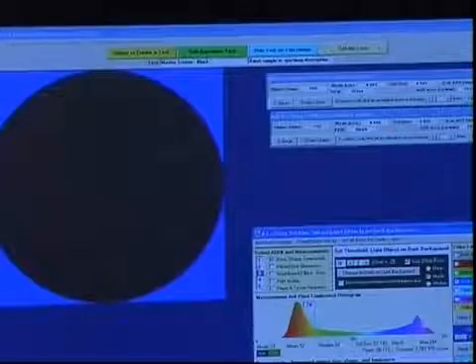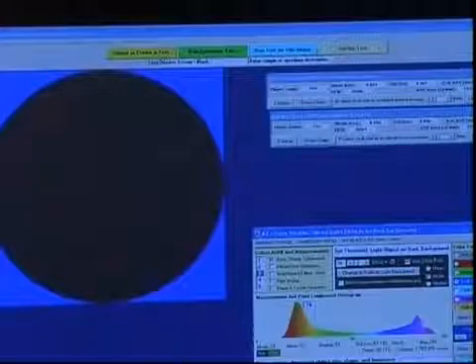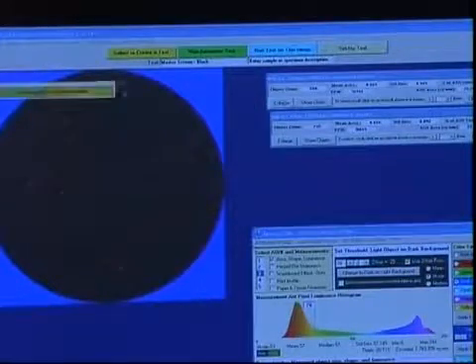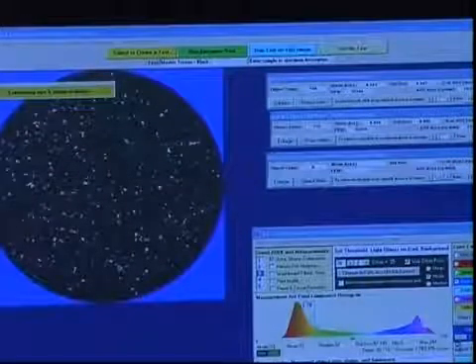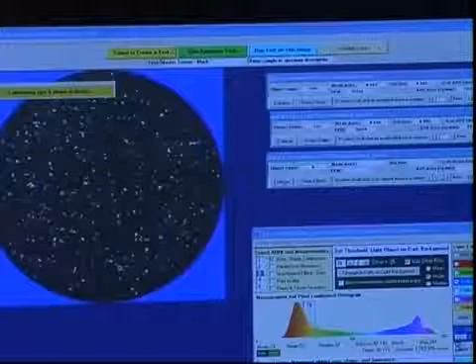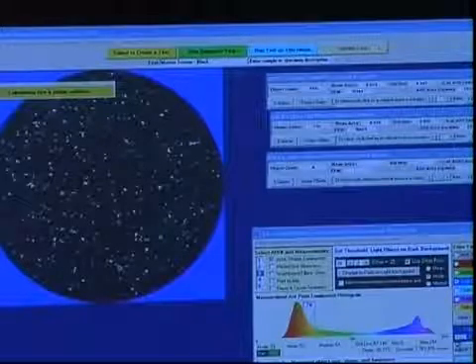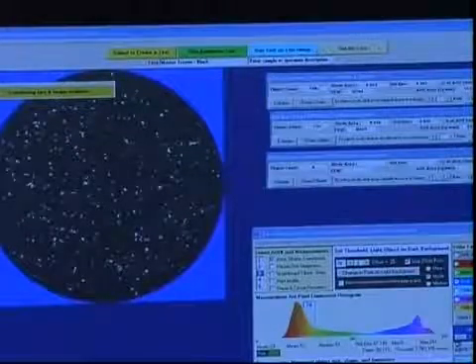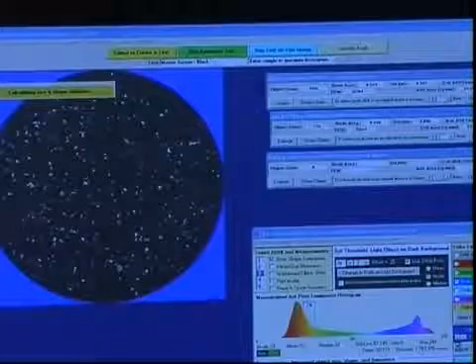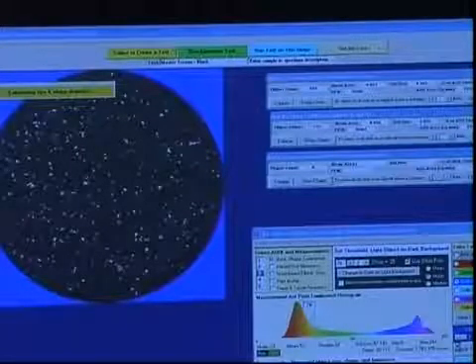So the filters now become all important on this particular measurement. It's not measuring. I didn't click it right. Here we go. Okay, now we got it started. And it will be busy for a while because there's a lot of hairy stickies in there too. Now, anytime you may not be interested in this level of sophistication, you can use the dirt counter just to count the white stickies and don't count anything else.